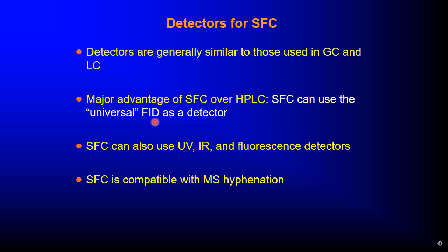Supercritical fluid chromatography can also use UV, infrared, and fluorescence detectors. So it is better. It is compatible with mass spectrometry hyphenation, so it is very nice.